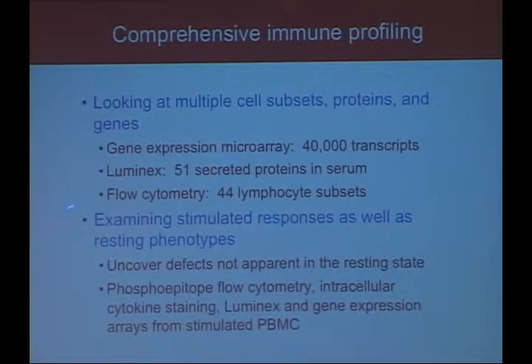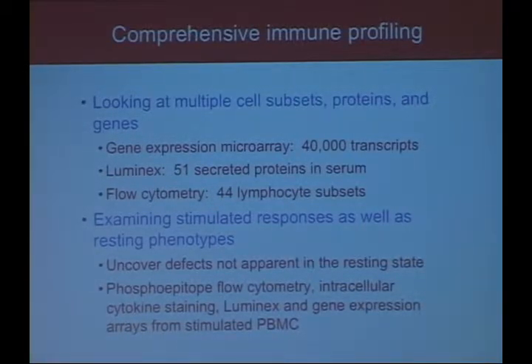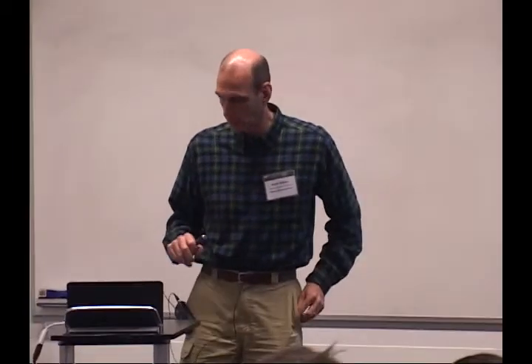And then a second driving principle that we have is to try to do assays that look at stimulated responses. In addition to just measuring the resting phenotype, as I'm sure you heard yesterday, you can uncover a lot of defects that you wouldn't otherwise see by doing some type of in vitro stimulation. In that regard, we do phosphoflow, we do intracellular cytokine staining, and we can also do both Luminex and gene expression arrays from stimulated cell samples as opposed to just from serum.